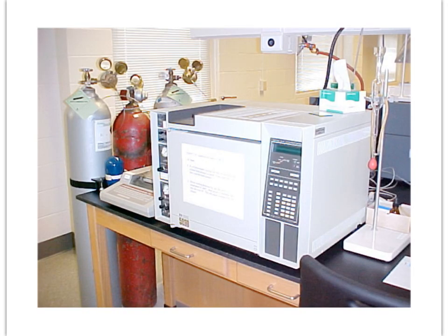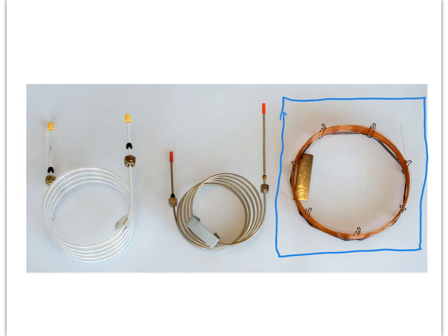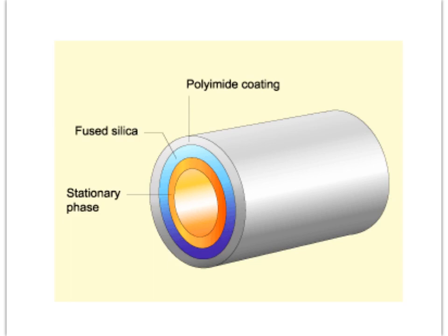So here's a picture of an HPGC, similar to the one that we will use, right? Remember that we are using a wound glass capillary column, and the stationary phase is a nonpolar coating on the inside of that fine glass tubing, right? So the stationary phase is this coating on the inside. That's what our molecules are interacting with. And so the question is, how much time are they spending essentially dissolved in that semi-liquid coating versus how much time are they spending off in the gas phase moving with the carrier gas, right?